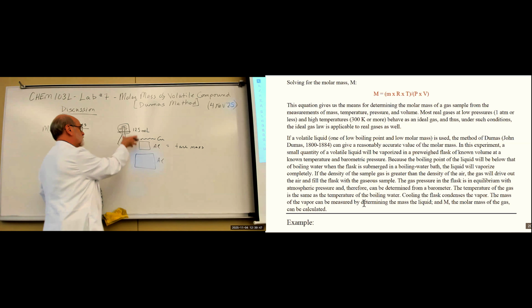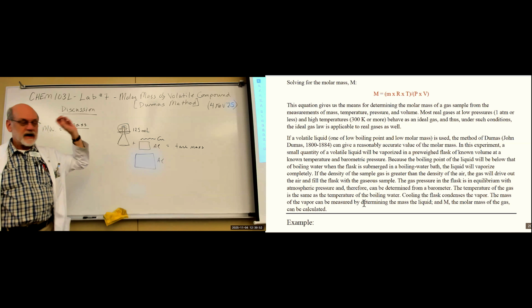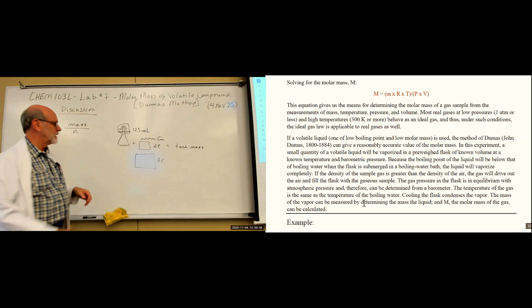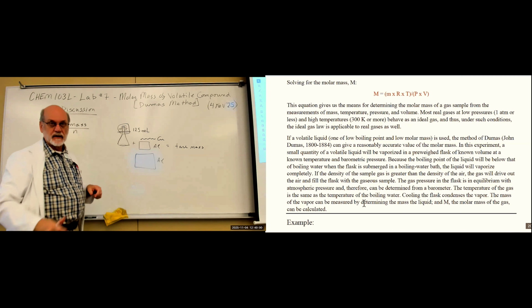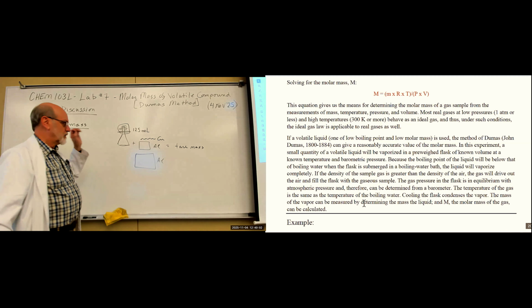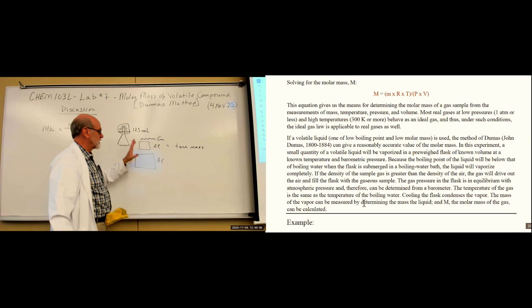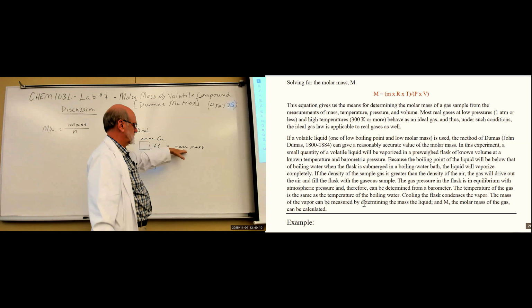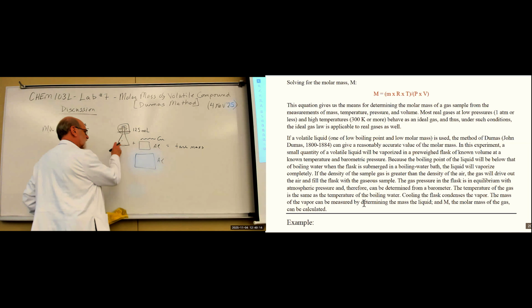So what we do is we just cover the whole thing with this. Then when we pull that off, this is dry up here and we can wipe the rest. And we don't include this large one in the tare. So first thing you do is weigh the empty, dry flask with the small aluminum and the copper to get the container weight.